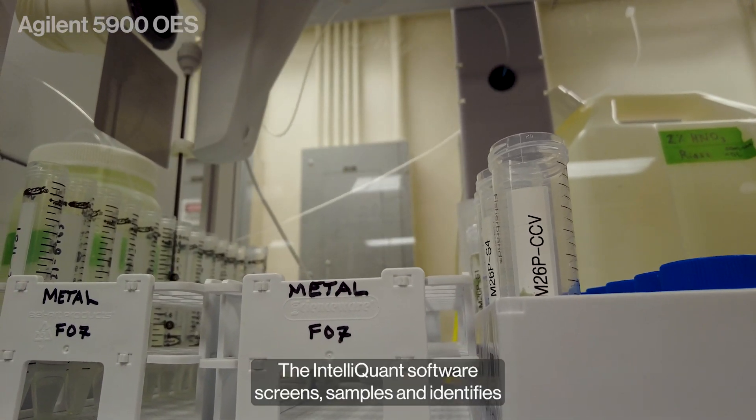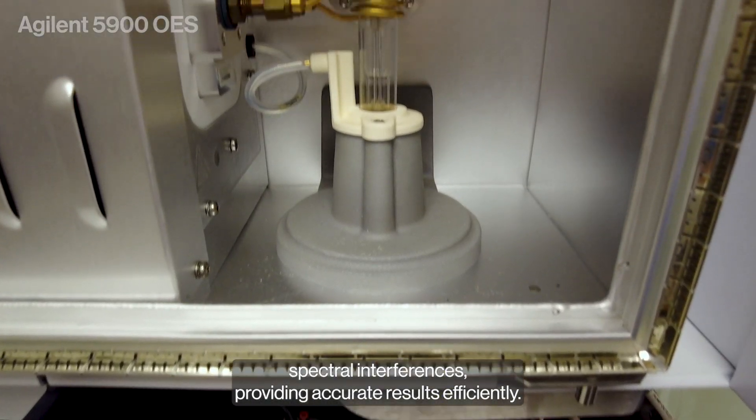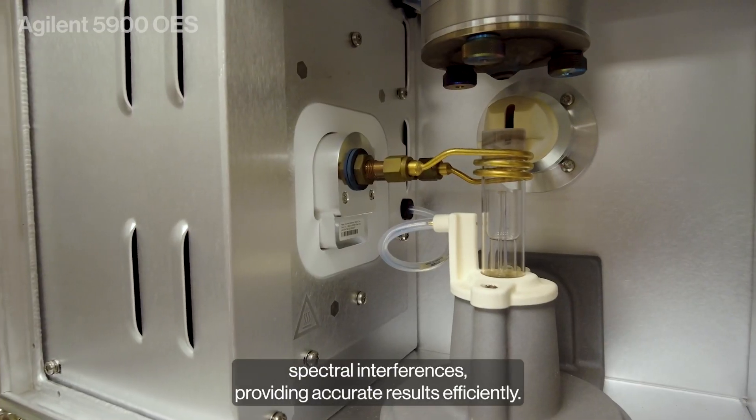The IntelliQuant software screens samples and identifies spectral interferences, providing accurate results efficiently.